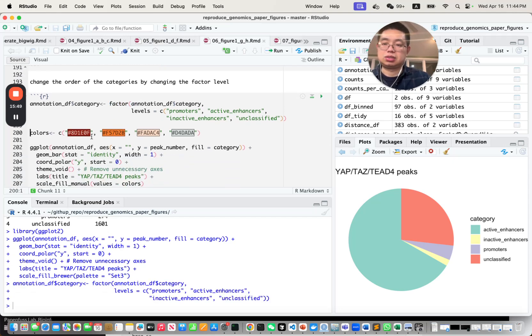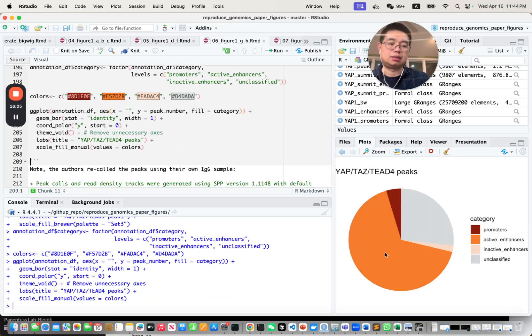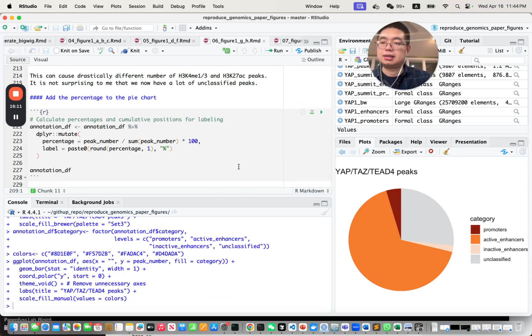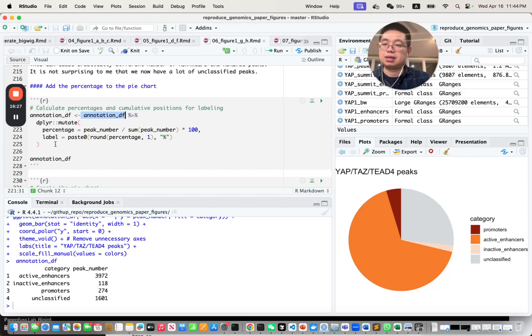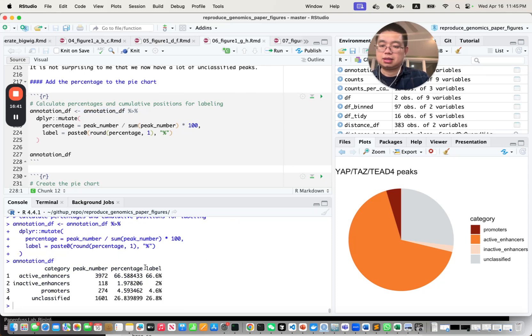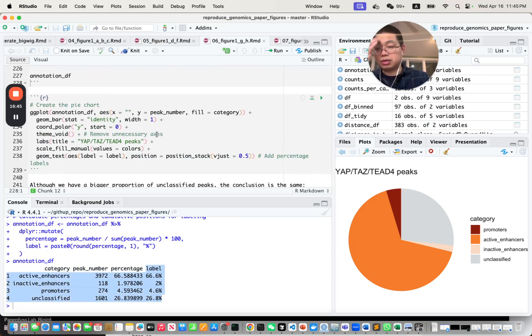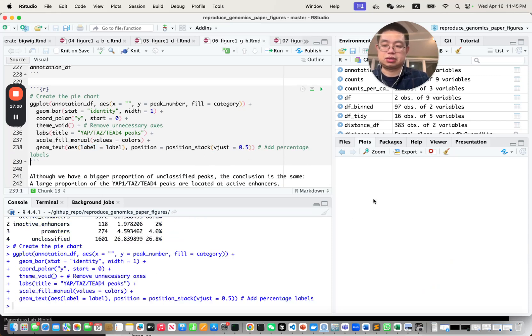Now we can also change the colors manually using the same ggplot call with manual color values, and change the order of categories. This is very similar to the original figure. We can also add the percentages for each category — calculate by dividing peak number by the sum of the column times 100. Using dplyr mutate to add a percentage column. Then we recreate the pie chart adding geom_text with label equals the percentage column.